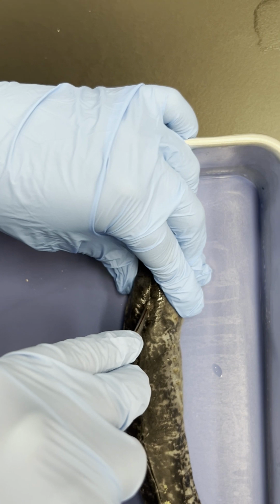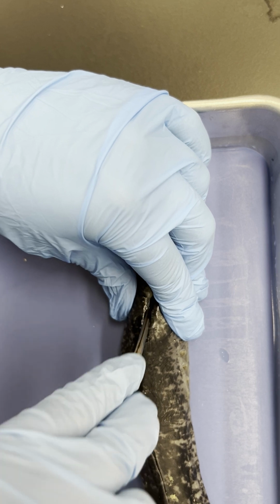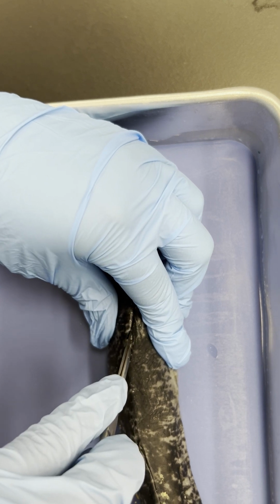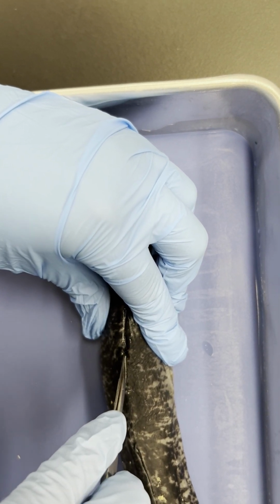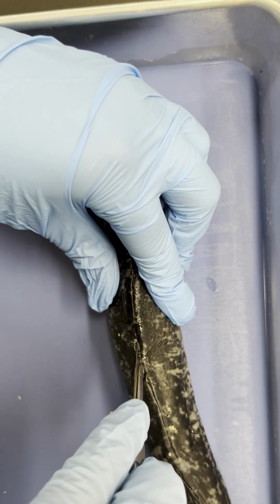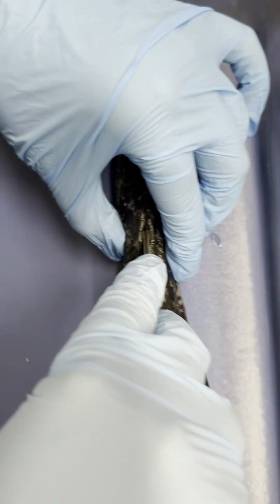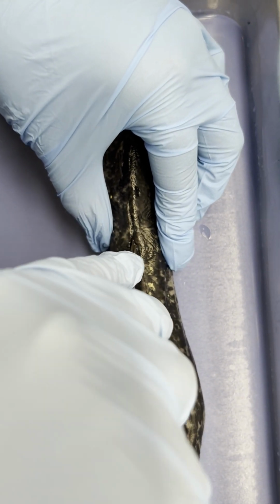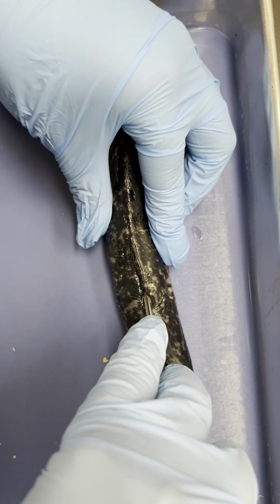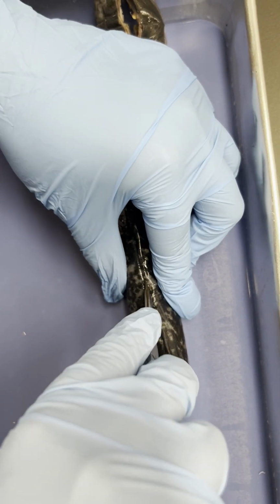Better to be slow and be as accurate as you can. And even if you just slice along the top of the animal and don't get all the way through, you can always go through later once you see where you're at. So we're just going slow here, trying to get everything as straight as we can. You can always reposition as you go on, so you move your fingers to hold the animal steady, which should make your cut a little better, and will also be a little bit better for decreasing your risk of injury.